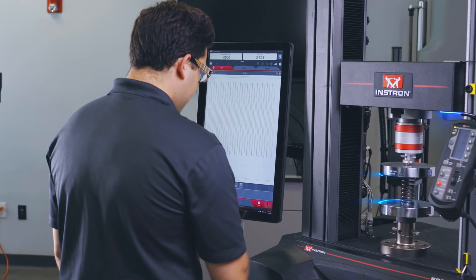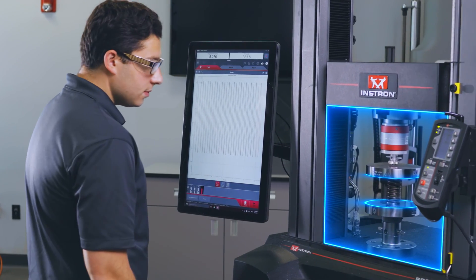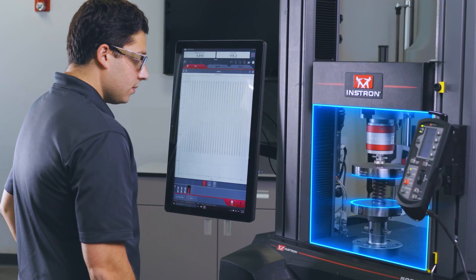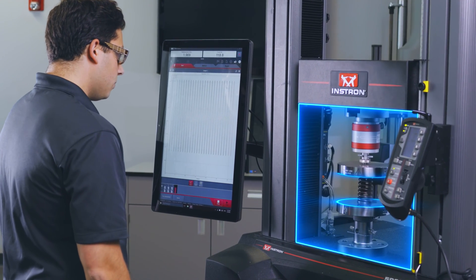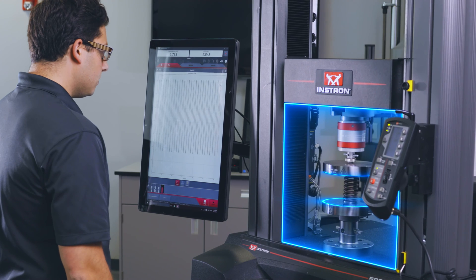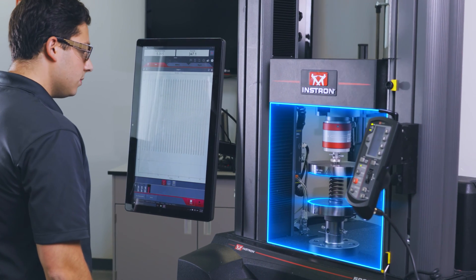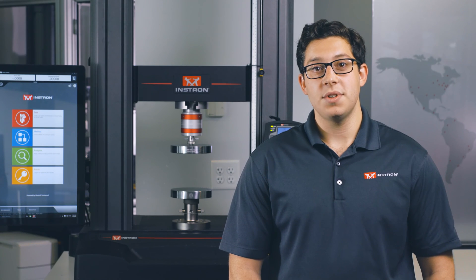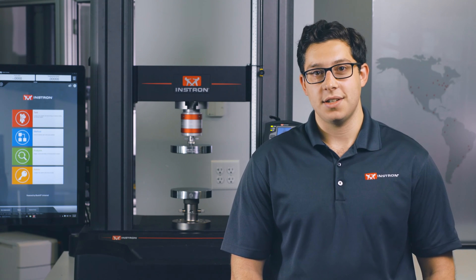The machine has no way of knowing what is in the testing space, whether it be your hand or a test specimen. When the crosshead is in motion, either during a test or return, you must keep yourself out of the testing area. The safety features and procedures we discuss in this video apply to all Instron Universal testing systems.